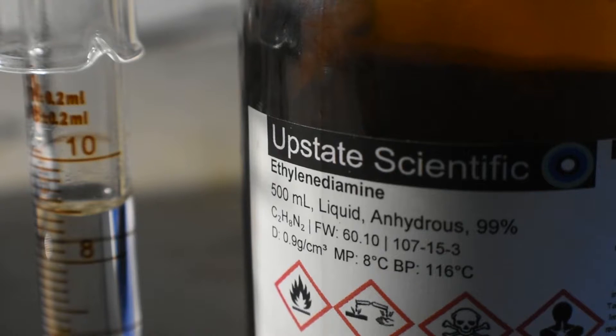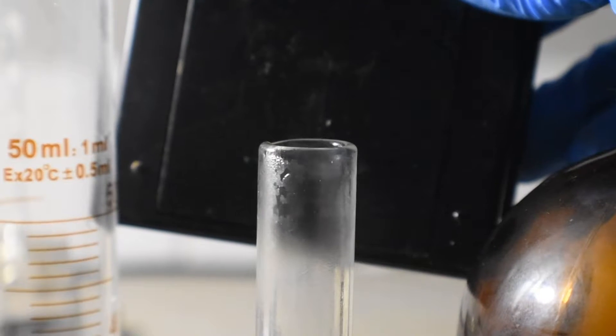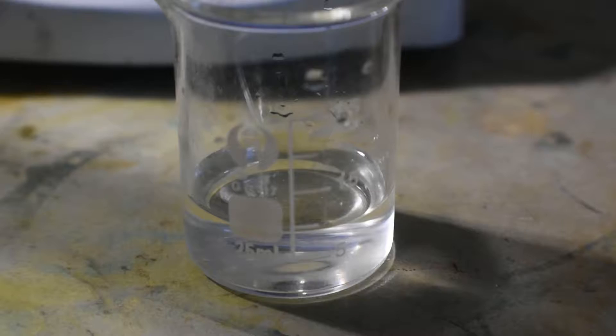The first reagent we'll need is anhydrous ethylenediamine. I've got 9 milliliters measured out, and I'm going to be adding this to 25 milliliters of pre-chilled, distilled water. Ethylenediamine tends to fume in air, so do keep this in mind.